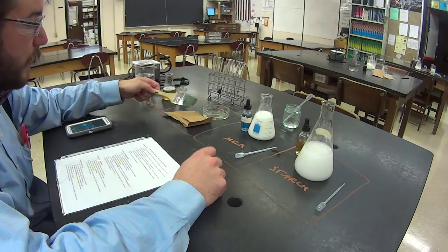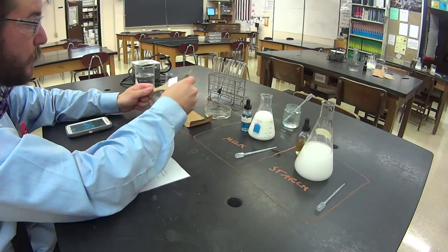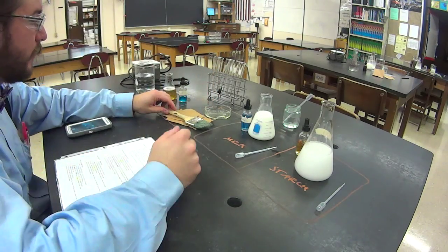Oil. You'll use this to test for lipids. This is a really cool, like, Bill Nye the Science Guy type thing. You just paint it on here and rub it around. And then the instructions.